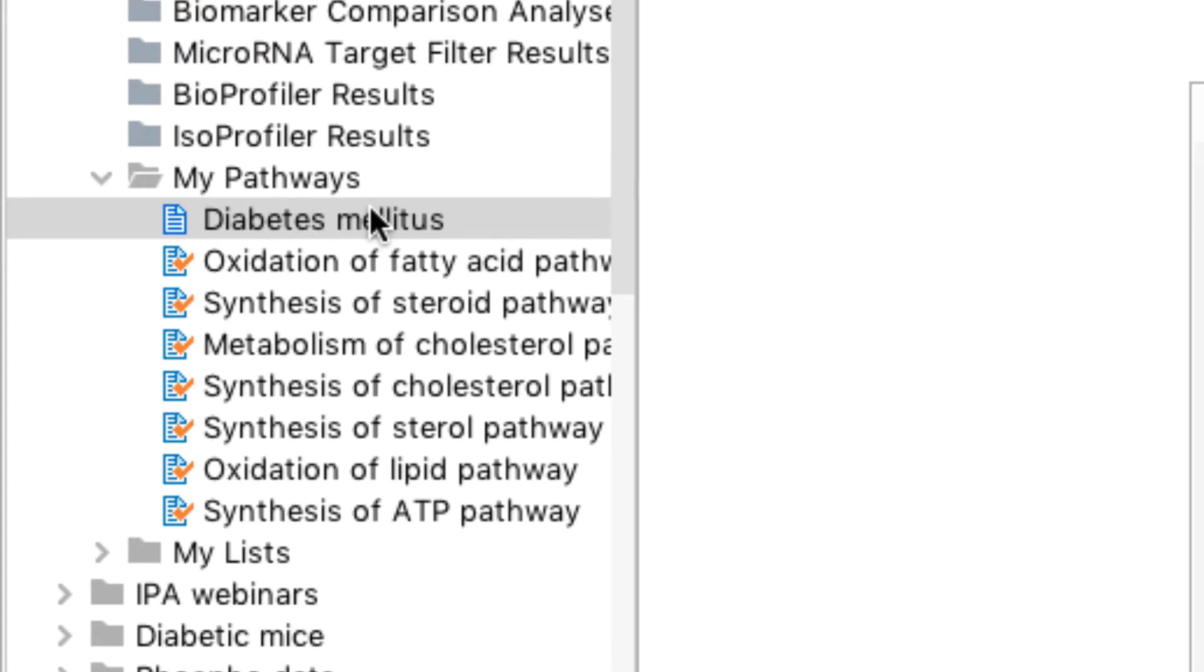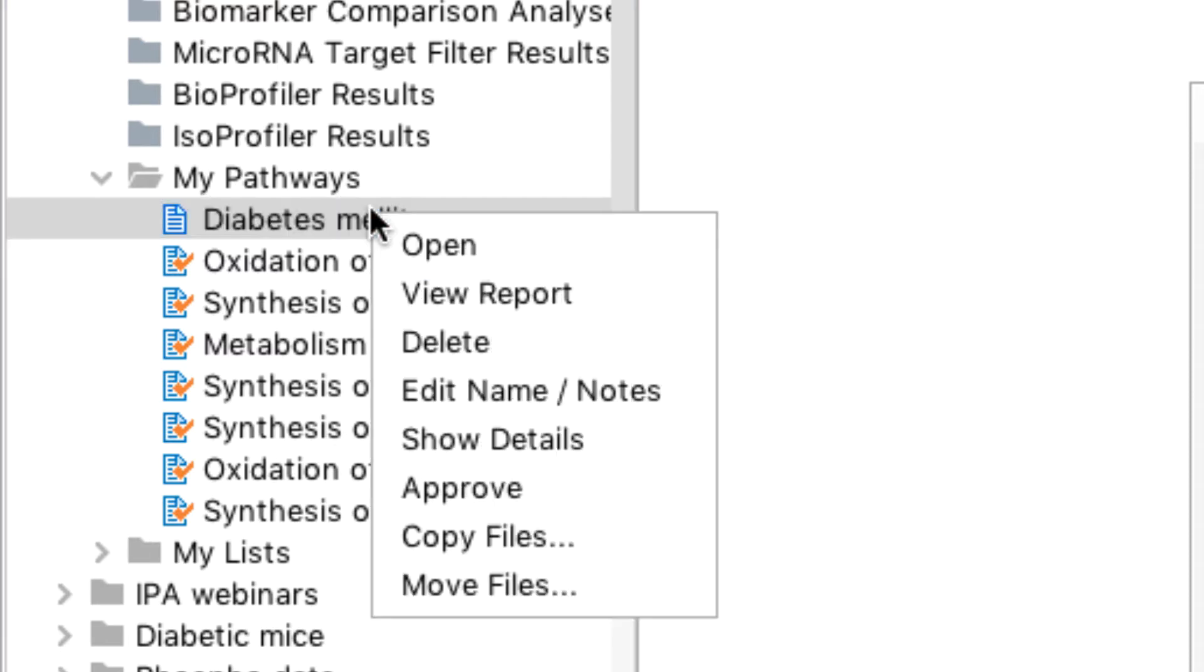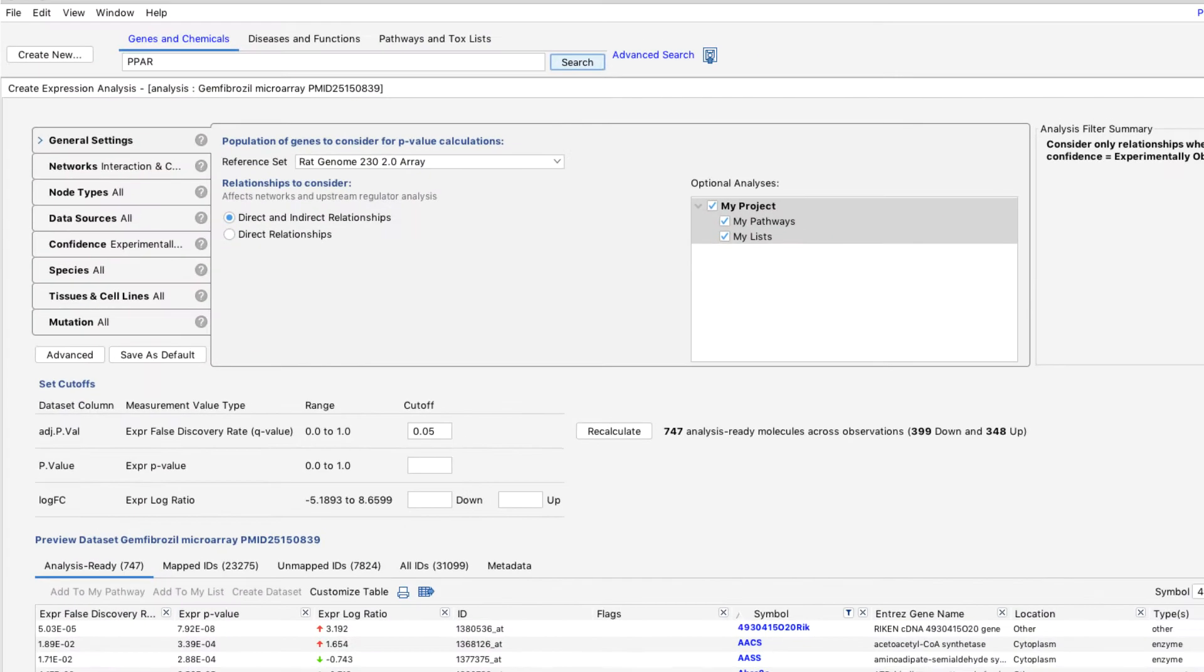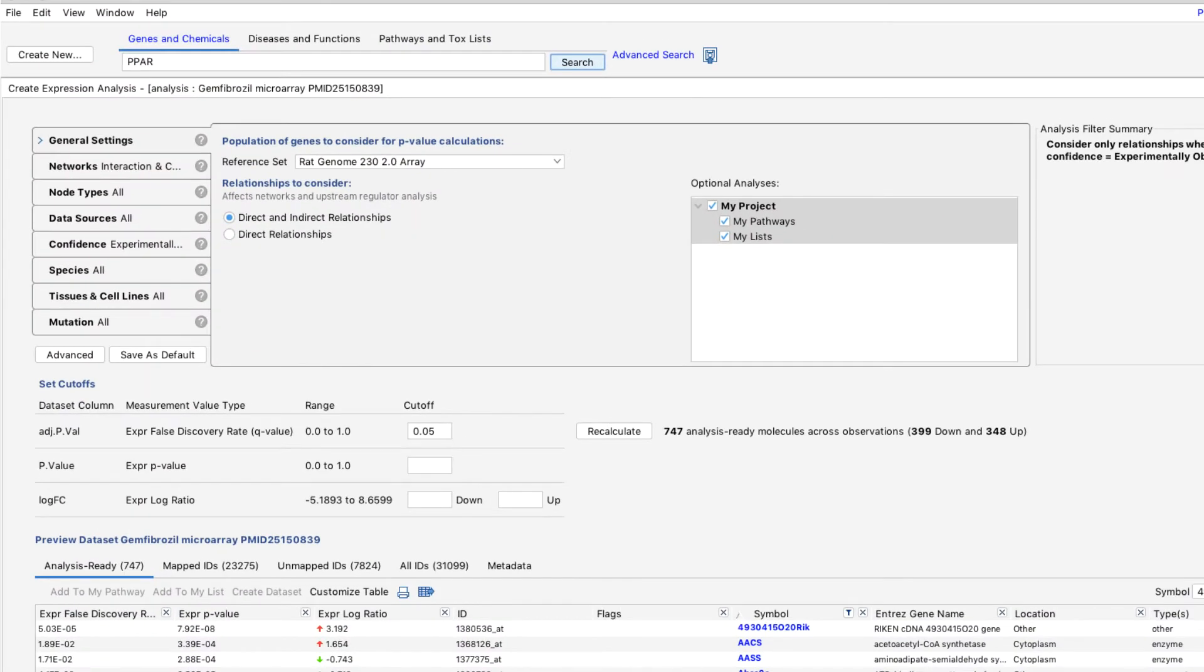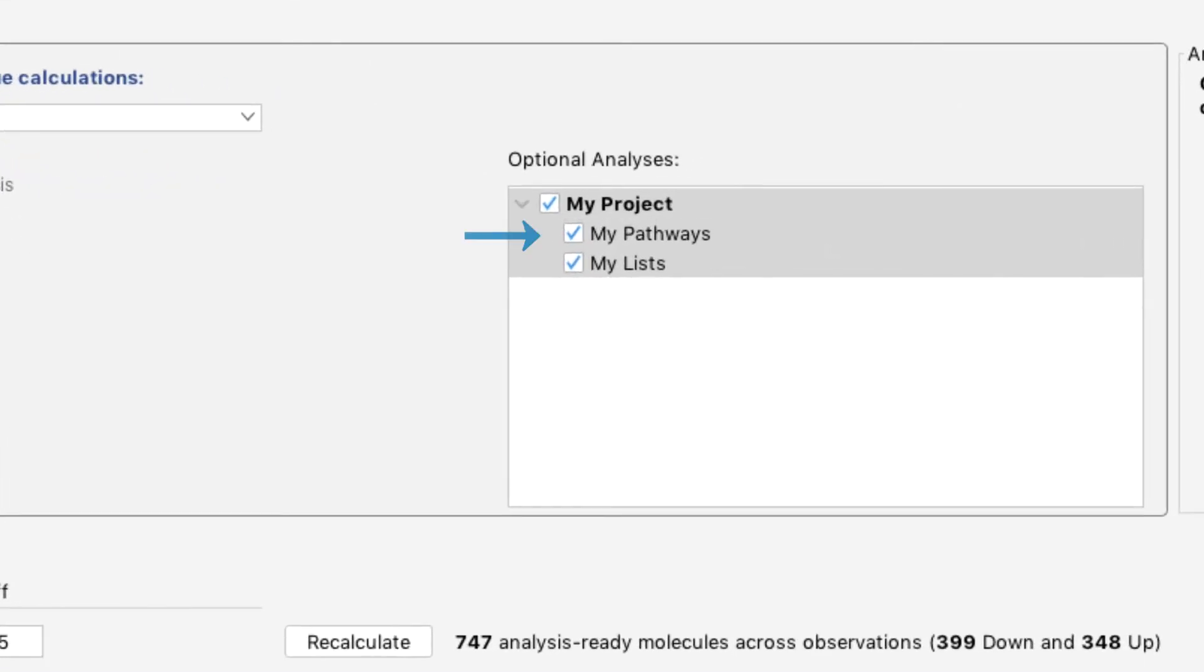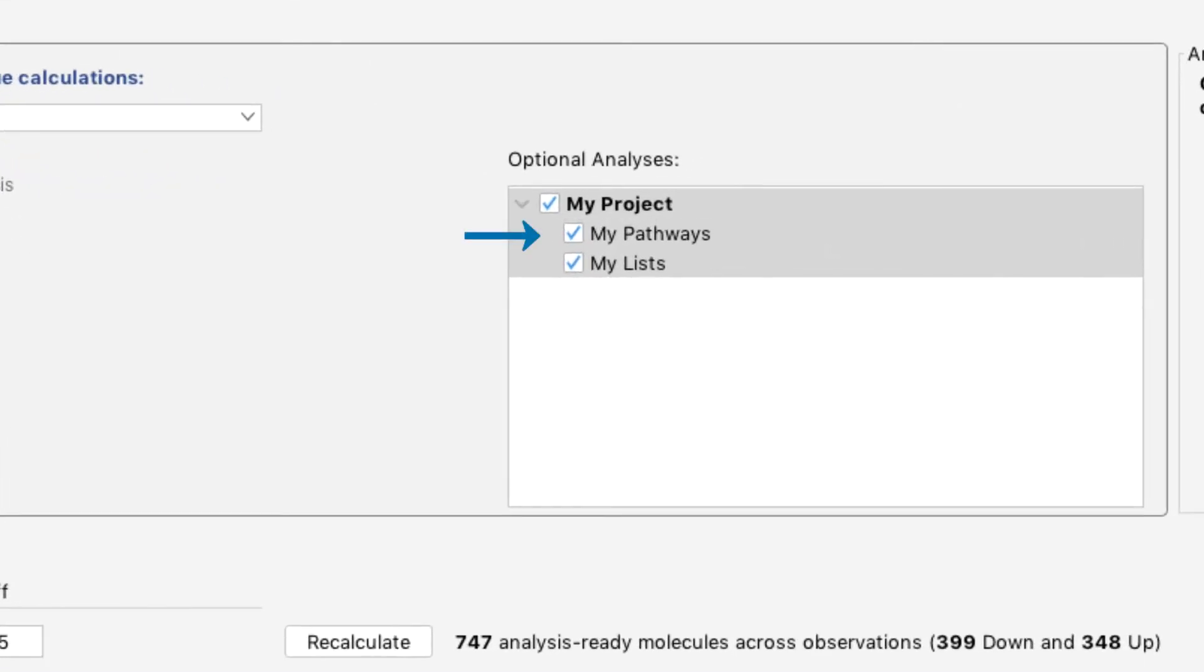To evaluate your analysis-ready dataset molecules for overlap against your custom pathways or networks in a core analysis, you will need to first approve each MyPathway for scoring. Then, when setting up your core analysis, you can select the option to include any approved MyPathways in the analysis.